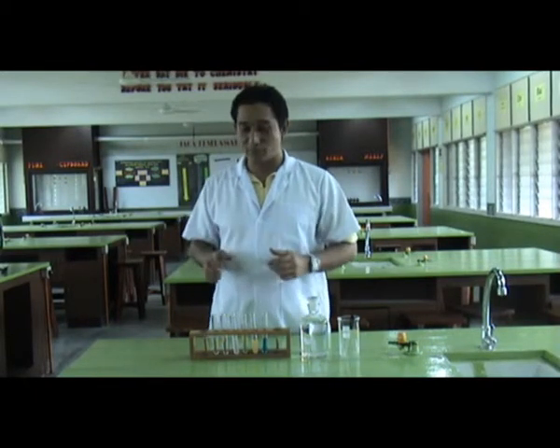Welcome to Final Experiment. Today we are going to demonstrate the cation test of several salts.